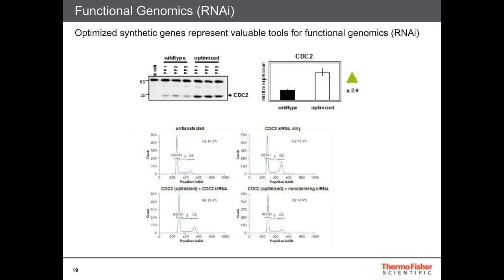And you do those rescue experiments by co-transfecting your siRNA targeting the endogenous gene together with an exogenous version of your gene in order to restore the wild-type phenotype. But those experiments were often difficult to carry out due to the unavailability of siRNAs which target the endogenous gene but not the exogenous gene you want to use for the rescue.